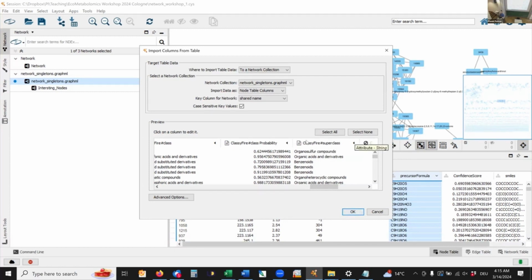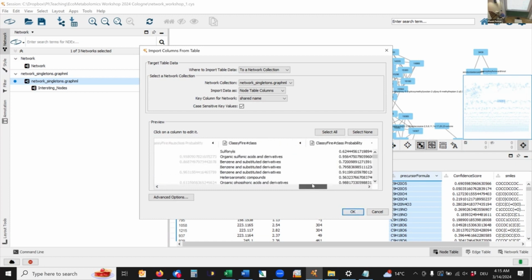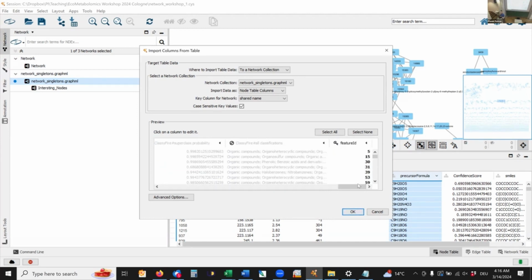Sometimes there are problems with the different numeric values you get, so whether something is a float value or not. So if it's numbers, then be mindful about the type of value. But I think for now here, these are all just strings, right? So it actually says it when you hover over it. So those are just string values, and it hopefully should be fine.